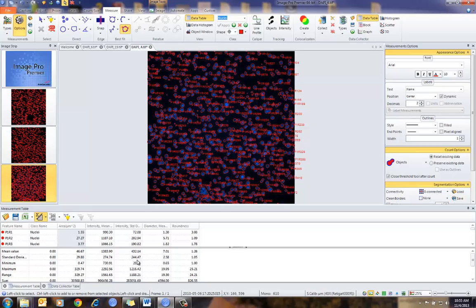That's a very, very powerful way of automating your processes. This can actually be tied into batch processing under the Automated tab, where if I'm automatically counting a folder of images — say 100 images — I can automatically set this up to accumulate the data in Data Collector and then report out that data in the format that I've set up.